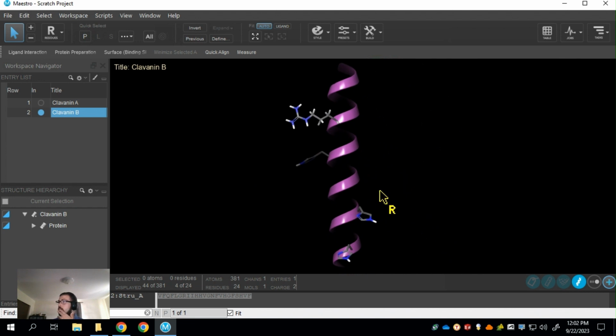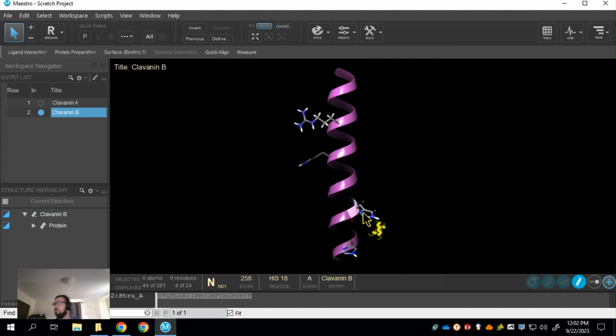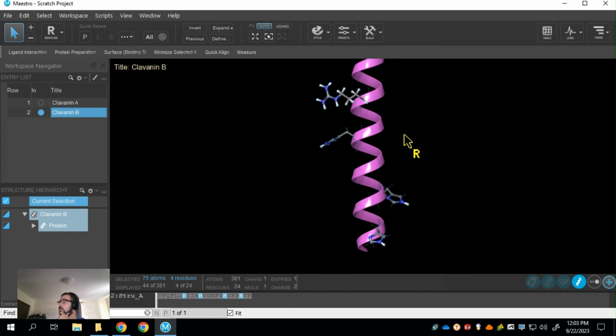And so basically I did the hard work to generate the first peptide, and the others are a cinch. And if you want to look at certain residues to make sure all of them are represented in a view that is clear, one of the things you can do is shift, click, click, click, and then come over here to the zoom option that lets you zoom on selected atoms. I don't love this option because it often means that the full peptide is not in view, but you can do that.